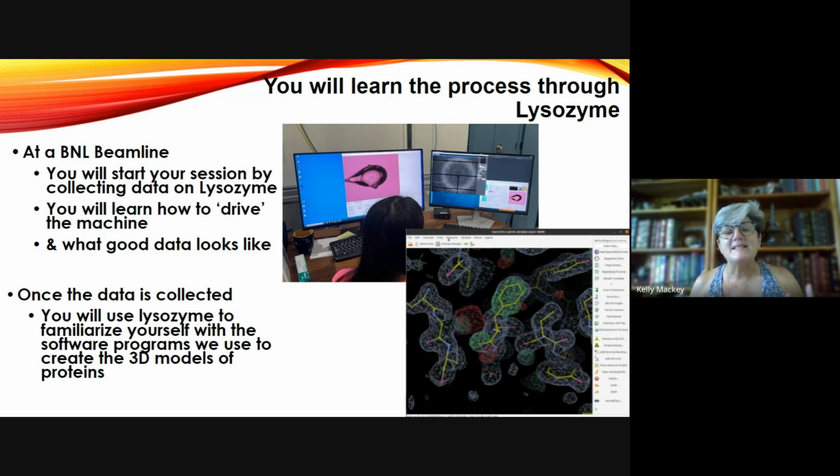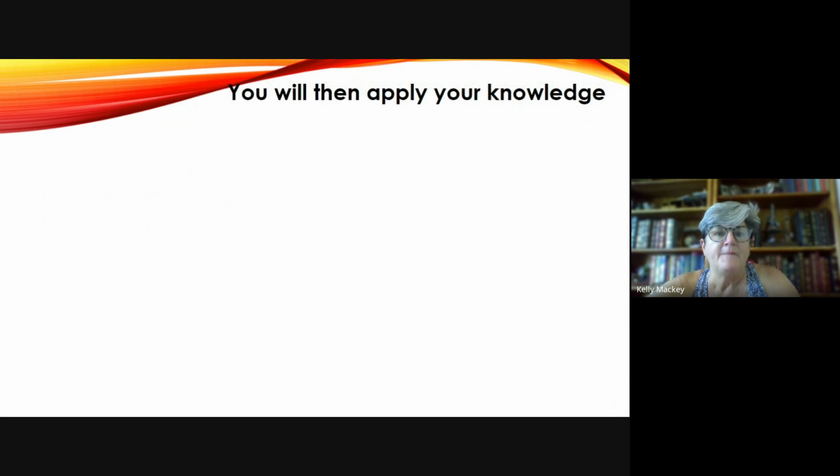And that's basically your workflow as far as the starting point of everything. We're going to use lysozyme so that you know how it all gets done. But by now, those of you who've been with us know that you're not really growing the crystals.